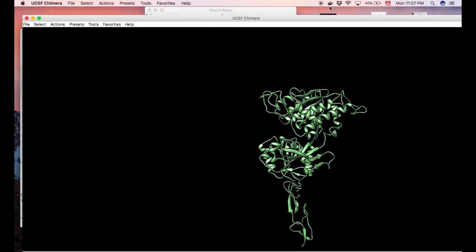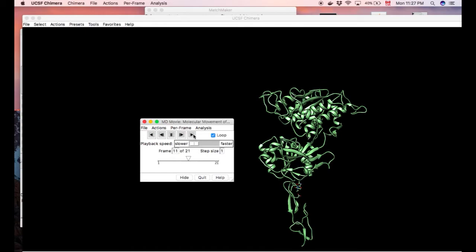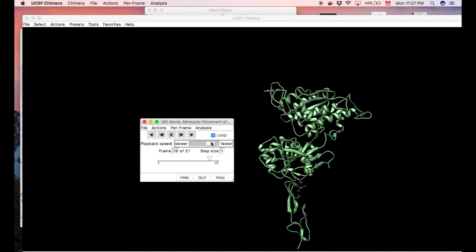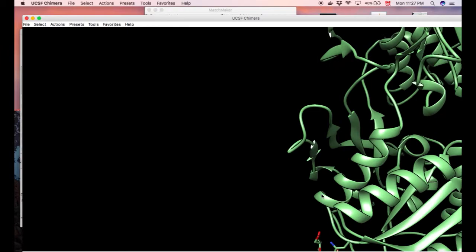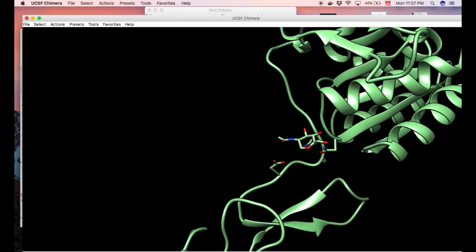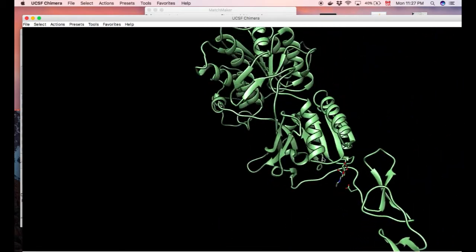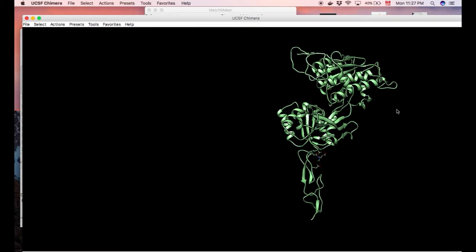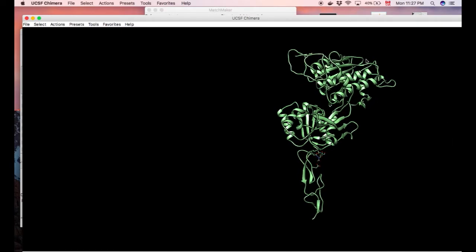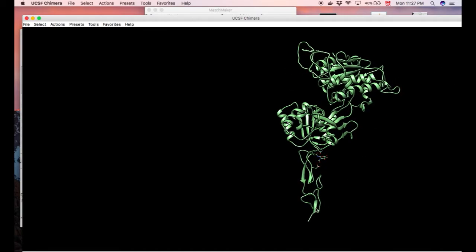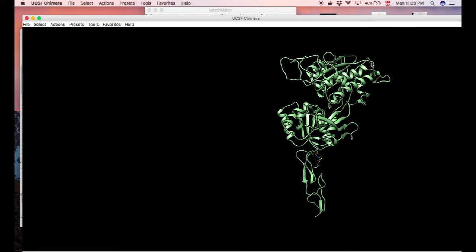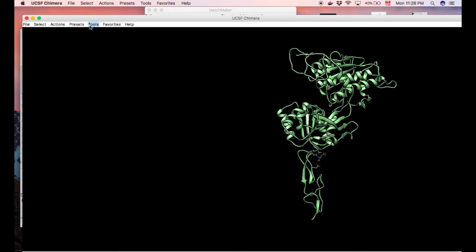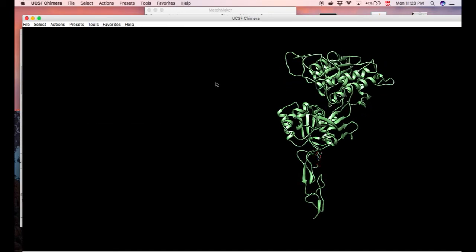So now we have our nice morph conformation. Again, if I can look at my menu, it's right here. Slightly faster. It can be very interesting. As you can see, there's multiple things changing. There's the conformation of this glycosylation. You can check at different positions. You can actually check between distances. And this can be simply very nice. Let's say at a lab meeting. And you're talking about the mutation of this domain actually can help you really visualize the segmentation of different domains and the activation. So here, usually you have the other dimer that would be coming in and actually getting very closer. While this seems to be actually getting much further. So this, you have the transmembrane domain right here. So I hope this was helpful. This is end of part four. And next time, we'll go over the rest of the remaining tools. So I hope you guys have a great day. Bye-bye.